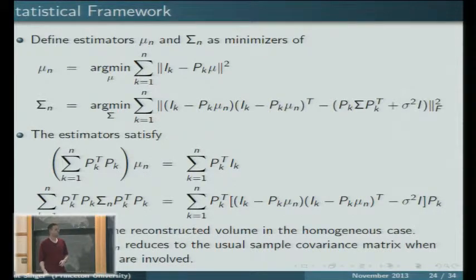Just a question. In the second optimization, sigma actually has some structure, right? Like PSD structure. So it's not a free variable. Right, sigma needs to be PSD, positive semi-definite, because it's a covariance matrix. Due to practical reasons, since we want our algorithm to run in a reasonable time, we drop this condition. We don't want to deal with it. And later you'll see that in any case, we're just interested in the eigenvectors corresponding to the largest eigenvalues. So if these are estimated well, we don't actually care about all the rest.